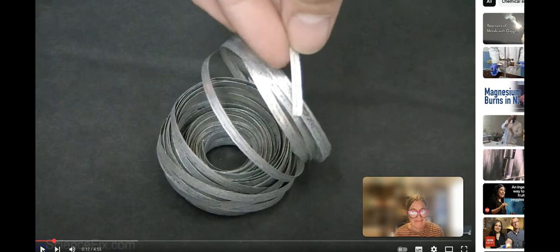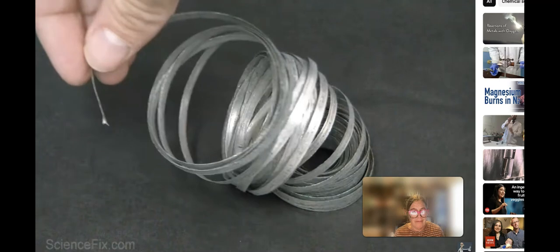Okay, for example, this is the reaction of magnesium with oxygen in the air. And if you listen carefully, the person who's doing the reaction gives you a lot of detail, a lot of observations about magnesium metal. And of course, you know what air looks like. So you can actually get quite a bit of information into your observation recordings from what this guy is saying. Then you have to write the balanced equation. Well, you've got metal and you've got oxygen. What we're going to do is try to react this magnesium with the oxygen in the air.